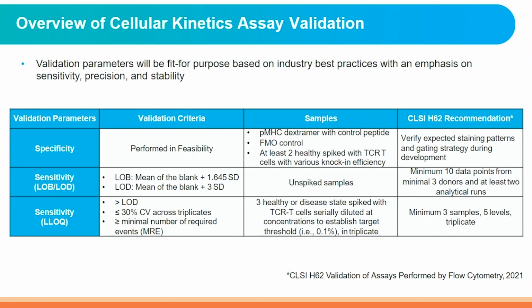Here you can see we have 3 validation criteria for LLOQ. The signal must be larger than LOD. The CV across 3 replicates must be equal to or less than 30%. The gated events should be equal to or larger than the minimum number of required events, or MRE. I will discuss MRE in a moment in the following slides.